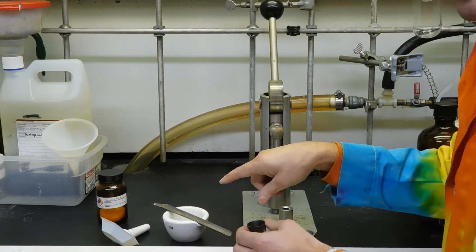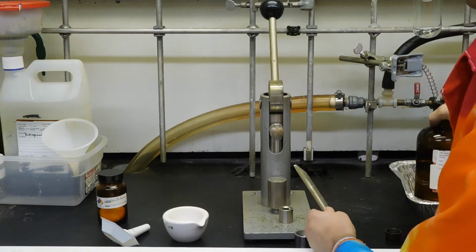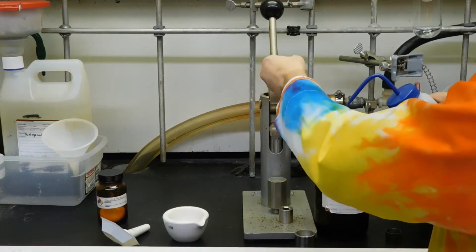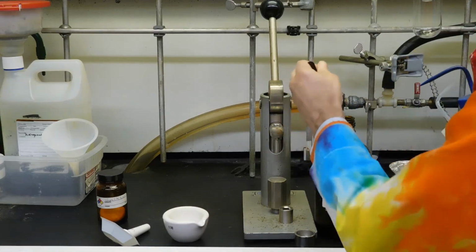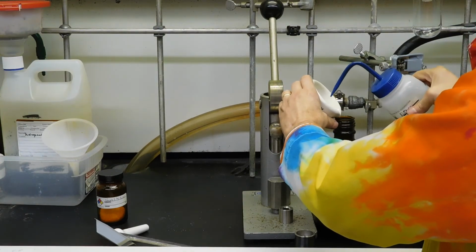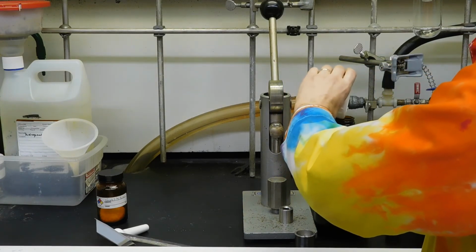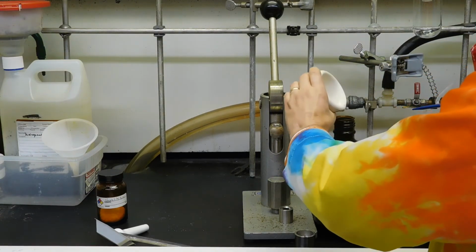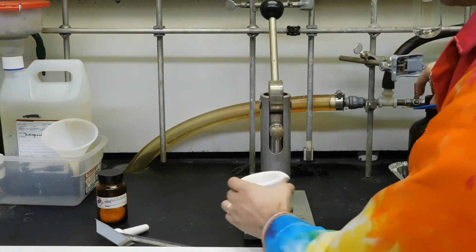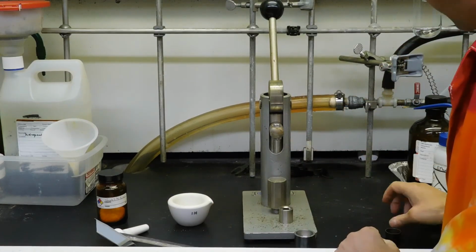Everything also needs to be cleaned off well for the next person. So what I usually do is simply take a non-halogenated waste bin, and this stuff is all soluble in ethanol. You can rinse everything off with a little bit of ethanol. And I'll probably just have a waste beaker for you guys to go into, and then we'll transfer it to the container later. If you're not sure everything's out of it or if it's wet, if anything's wet, you'll have to wipe it off with a Kim wipe before you use it.